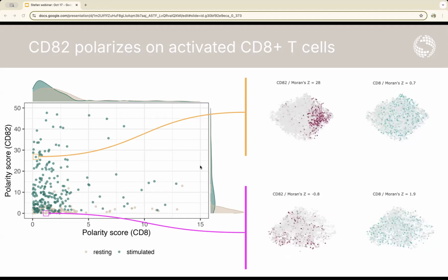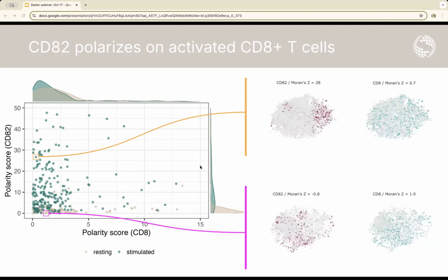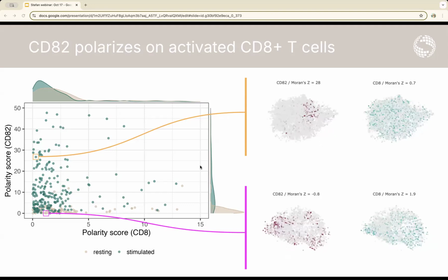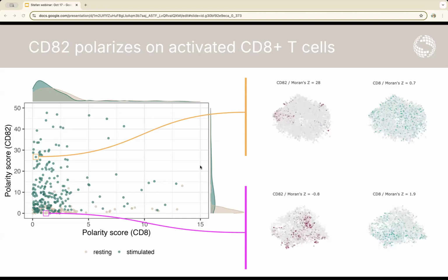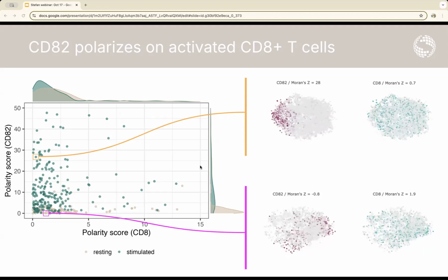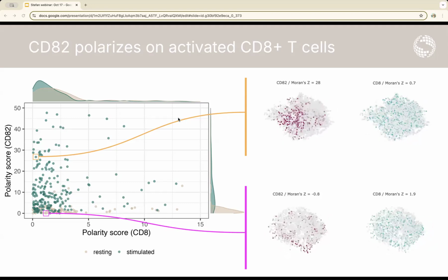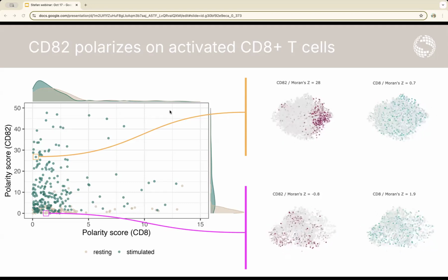The data being three-dimensional opens up the possibilities of looking at these cell graphs from every side and every angle. These are three-dimensional structures. We can transform them and spin them around any way we want. So this is something that you can easily do with MPX data.